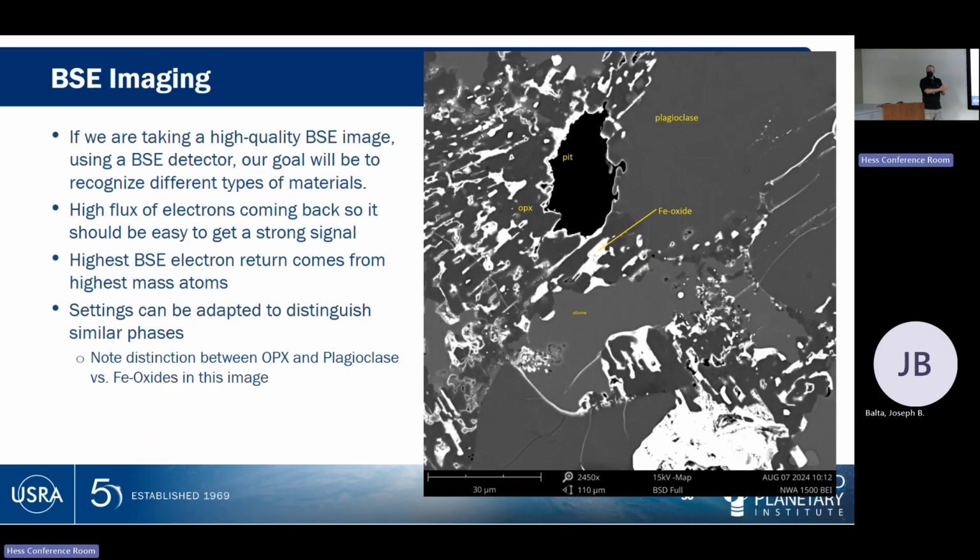And then you get to play with contrast. You get some response that is a certain number of electrons coming back over this area. Well then, do I want to adjust the contrast to see all of the materials that are in there? Or do I want to narrow it down to a certain band and do digital processing on that? That will be in the image processing here.